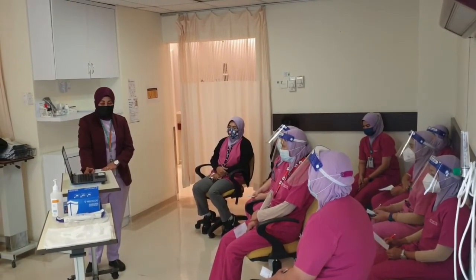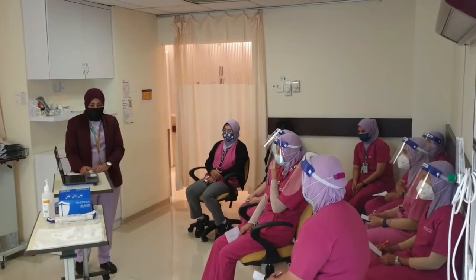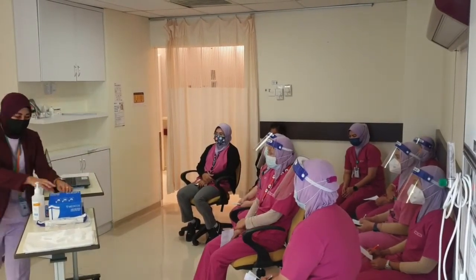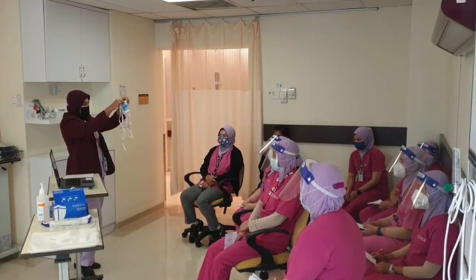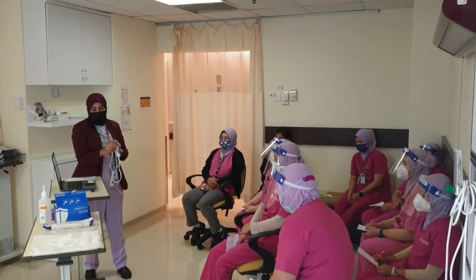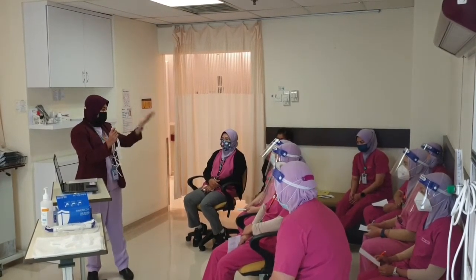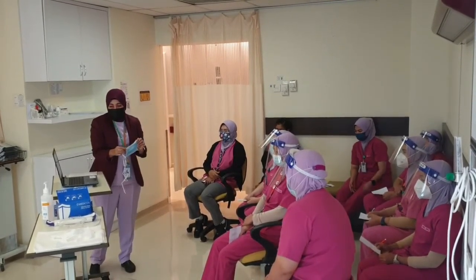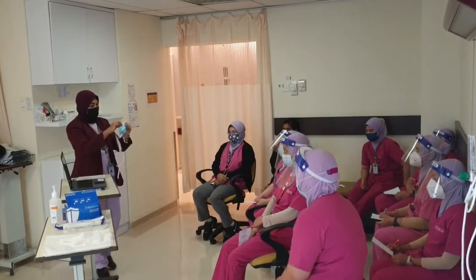This slide shows how to properly wear the mask. The mask has a metal nose piece at the top. That means here, right? There is a metal tip. The white or smoother side is on the inside against the wearer's skin, and the colored side faces out. See? The color faces out, then the white inside. The ties fall downward and away from the nose. This one, downward.